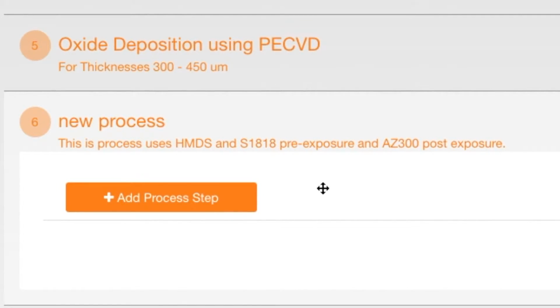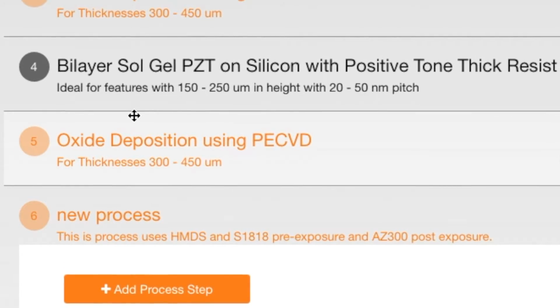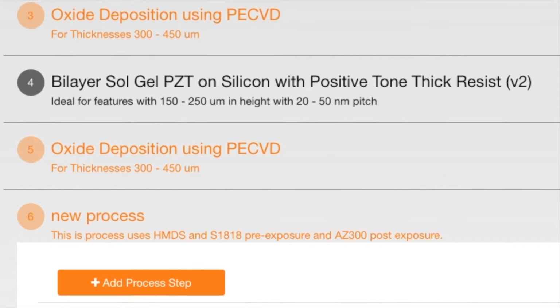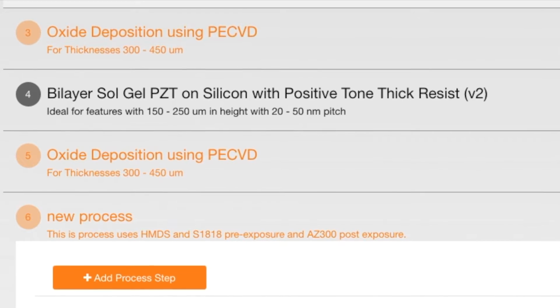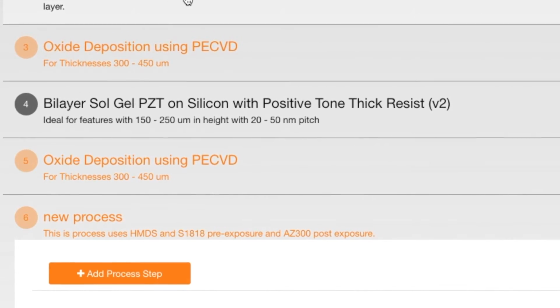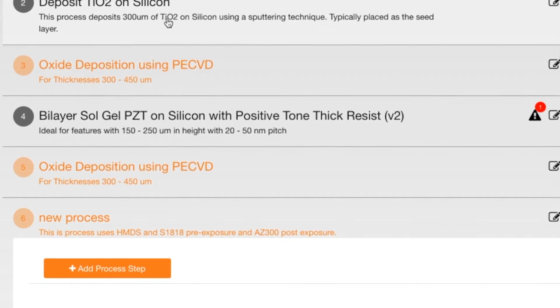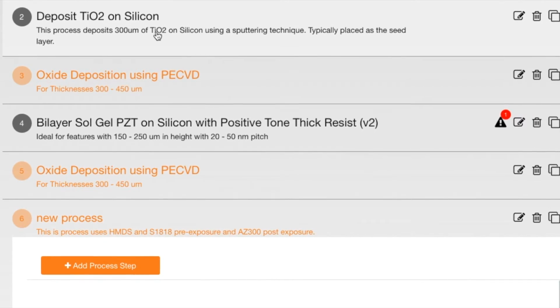But a quick recap: it's just important to understand the difference between these known versus experimental processes, or my user processes, quickly highlighted again by gray versus orange. So, well, that's a lot of information to take in. I think as we start to digest it and you run through one or two of these experiments, you'll understand why that's so helpful, and it makes quite a bit of logical sense as it starts to tie into more features with the rest of the system.